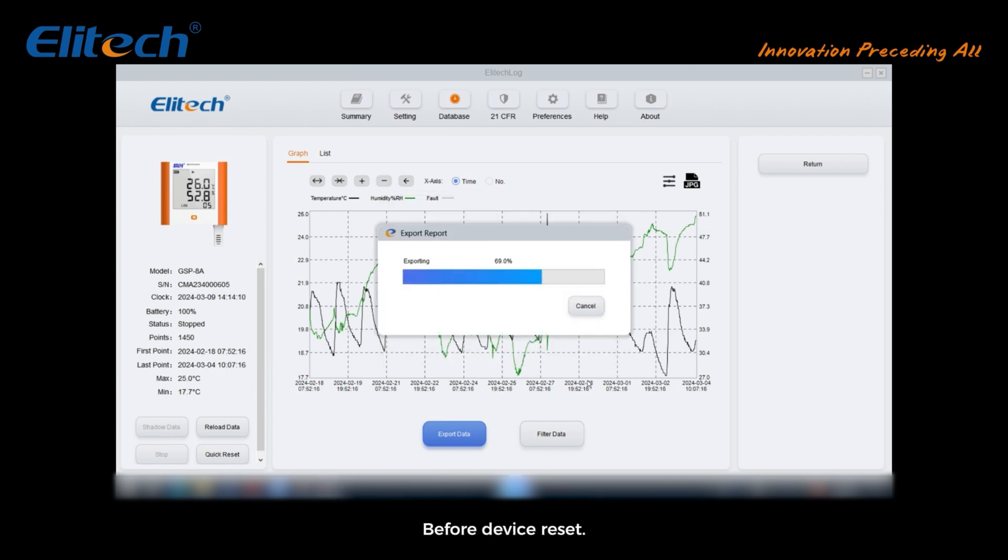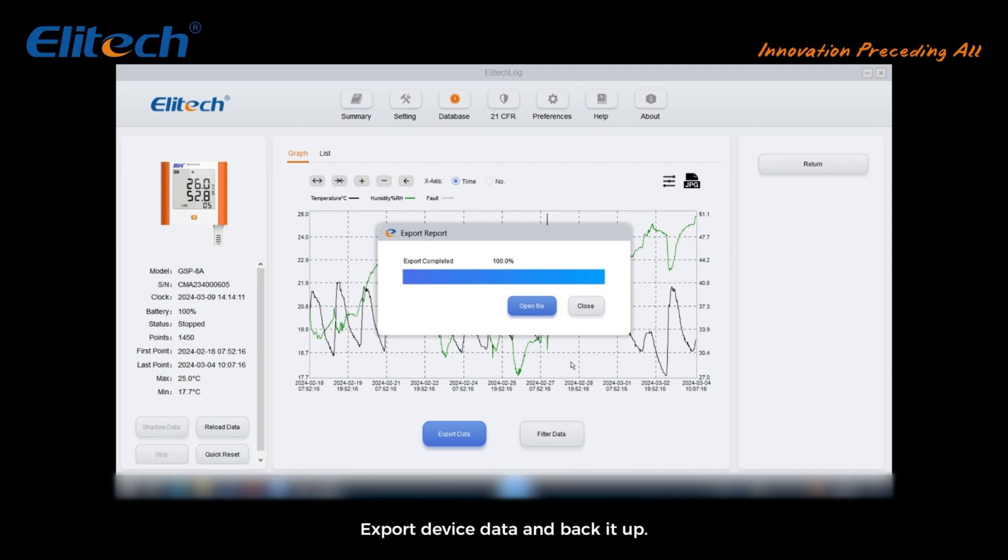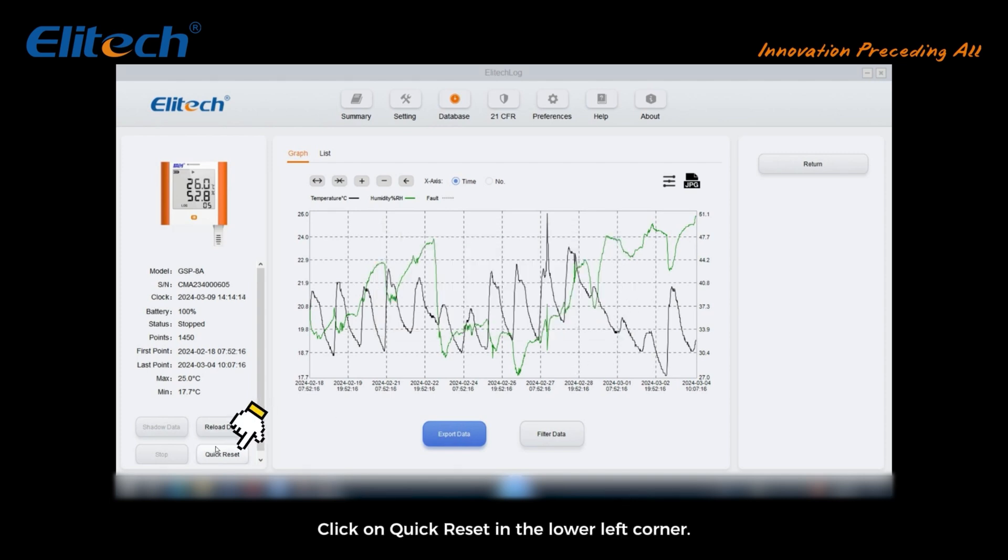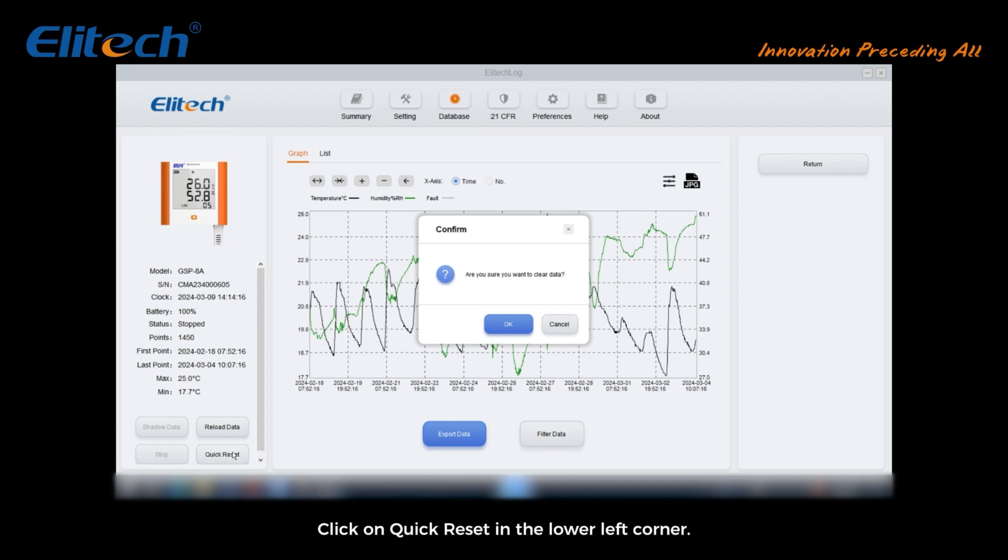Before device reset, be sure to plug in the computer, export device data, and back it up. Otherwise, the data will be erased.